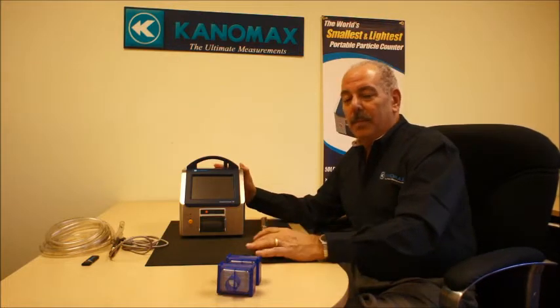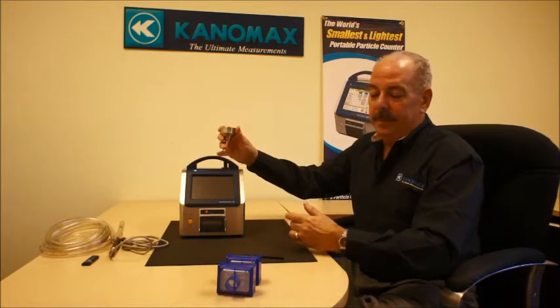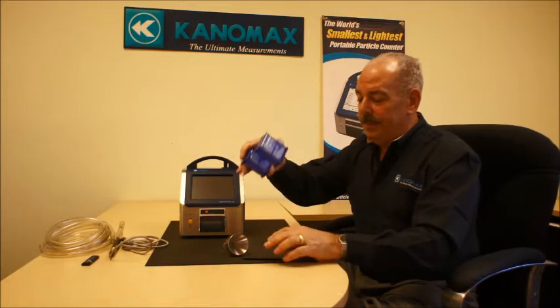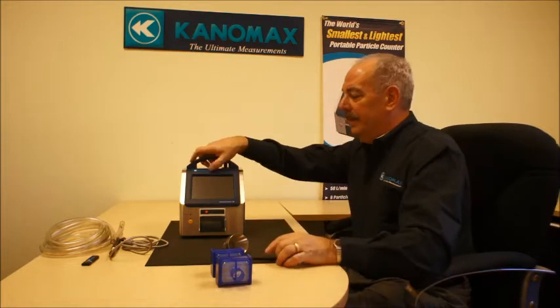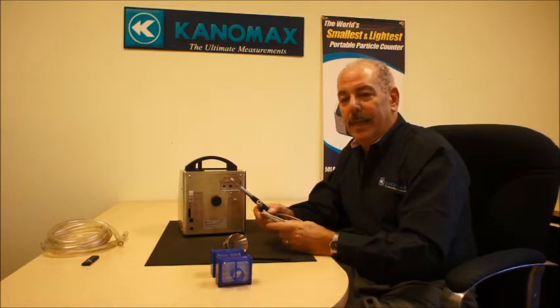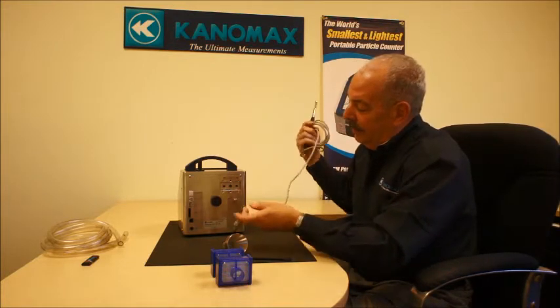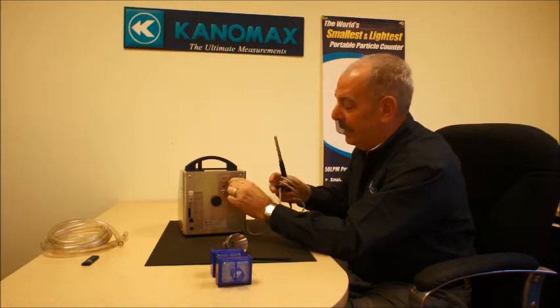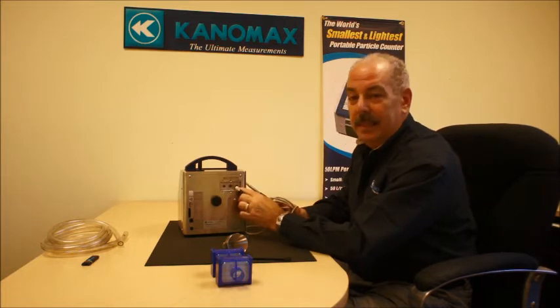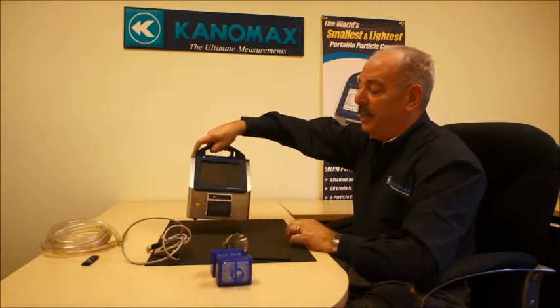The unit itself comes with an isokinetic probe — you just put it on the inlet — and comes with a zero filter to be able to zero the unit each time for use. It comes with a stylus. Optionally, it has an environmental probe, which is basically our temperature, relative humidity, and velocity probe from our KlimoMaster — a very accurate probe. It plugs in here and also has the availability of an external alarm connection as well as a differential pressure connection, so you can do additional capable measurements from the same instrument.